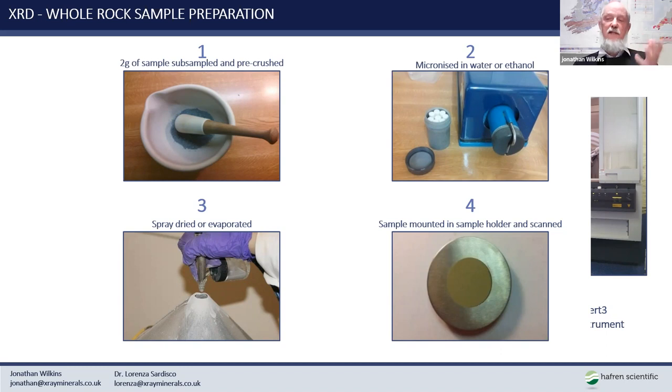So everything to do with mounting the sample is designed to make the resulting powder mount both as dense and homogeneous as possible, but without actually introducing into it the preferred orientation of minerals like mica and feldspars or calcite, for example, which have a perfect rhombohedral cleavage. The way that we do it is to actually chop onto the sample with a razor blade, and that is able to compact it without actually introducing orientation into the system.